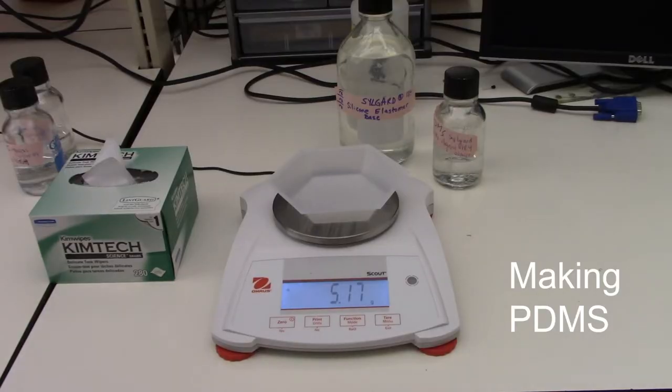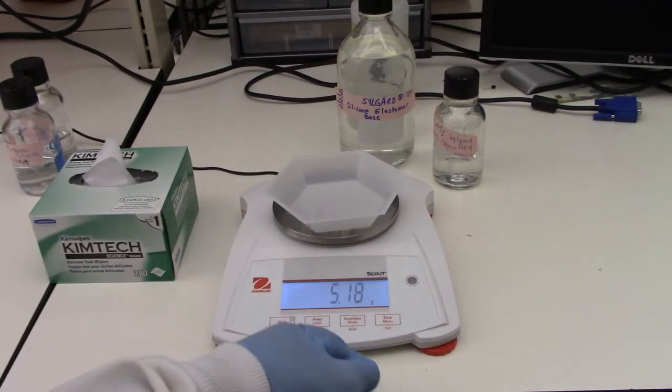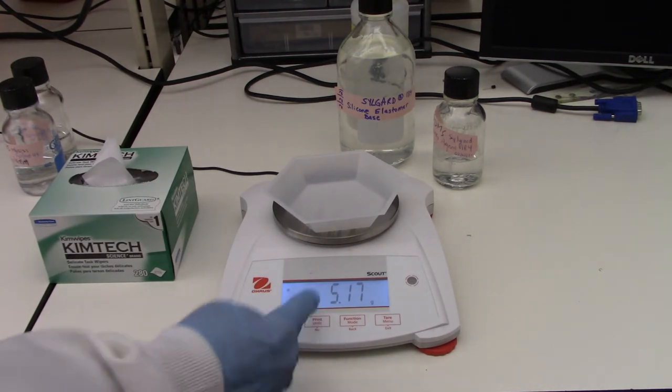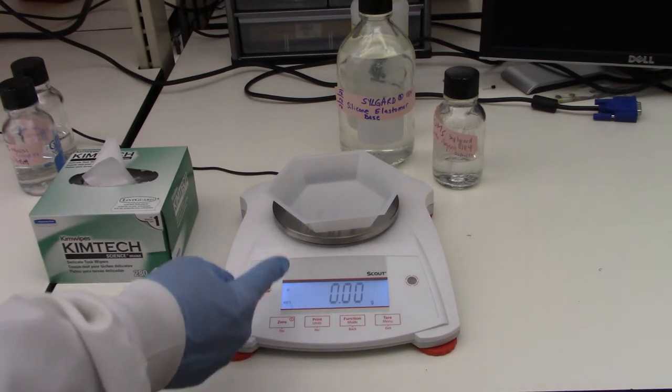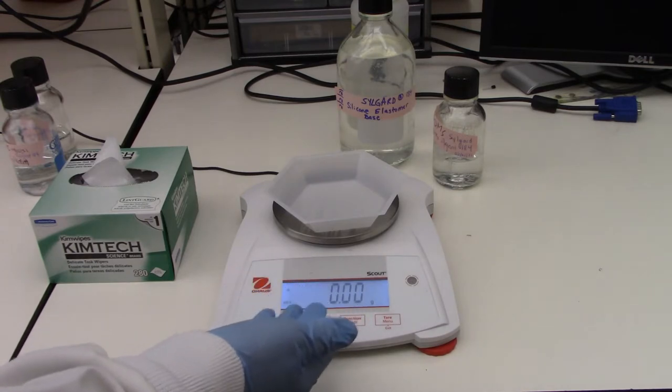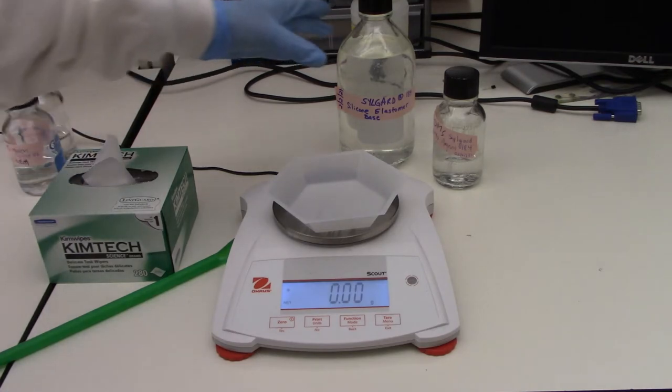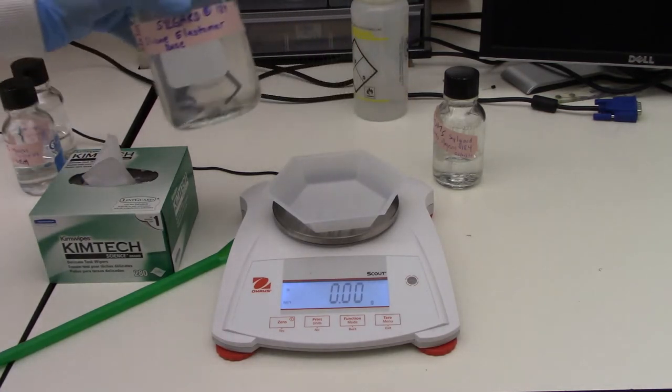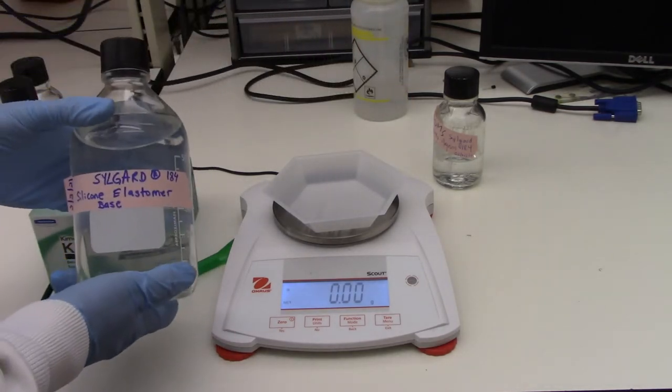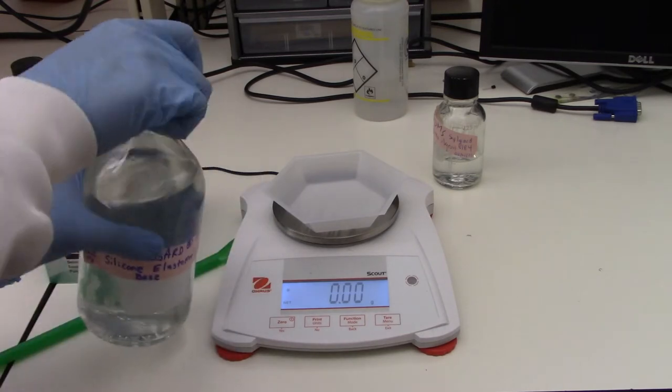To get started with making our PDMS-based device, first we're going to take a weigh boat, put that on the scale. With the weigh boat on, we're going to tare or you can press zero. Basically, we want to weigh out the appropriate amount of elastomer or PDMS based on the weight. And so the ratio that we want to use is a 10 to 1 ratio. So I'm going to start off pouring the PDMS base and I'll pour 30 grams.